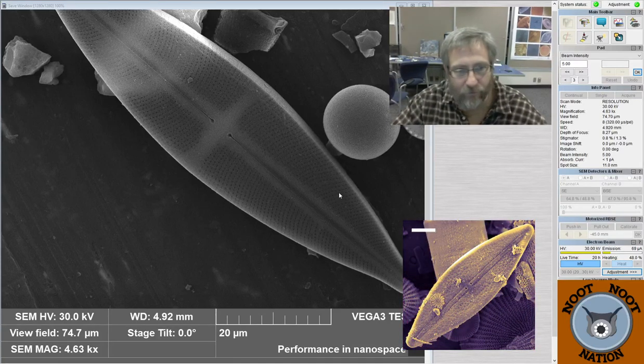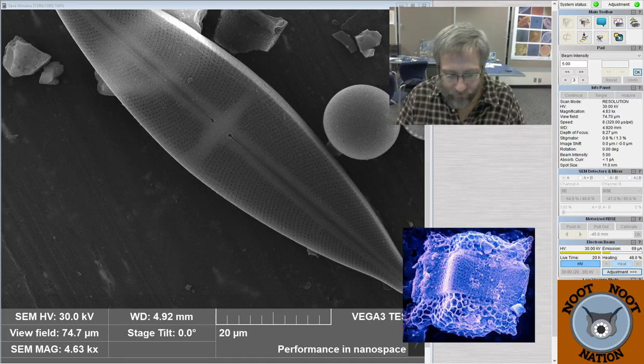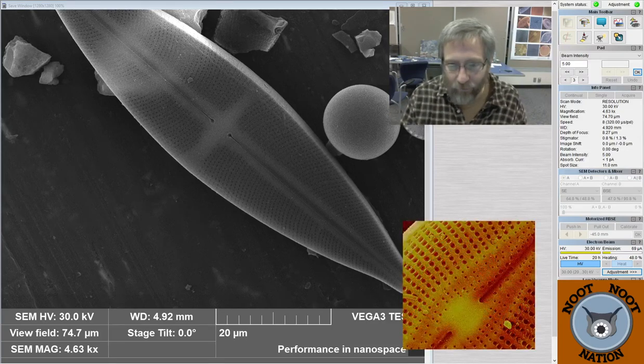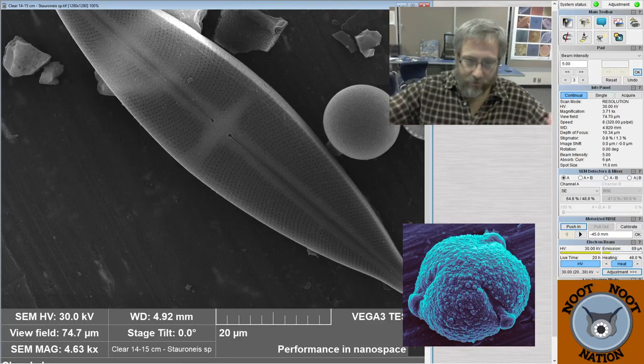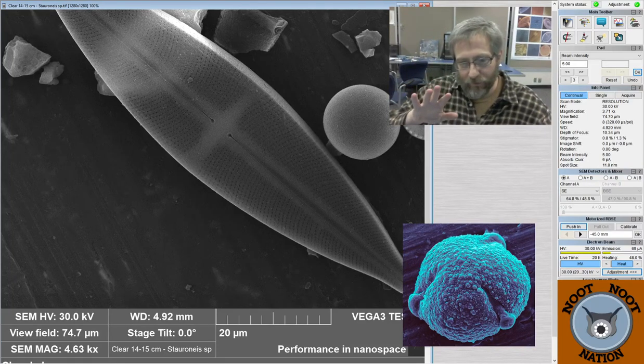The Tescan Vega 3 is the model that we use, and I actually really love this about it, which makes it easy. People tried to do this before we did ours, and they had a hard time with it because it's really hard to get the SEM to get you right into the right location all the time. To spin it around, which is normally what you would do with photogrammetry, you put the object on a lazy Susan, right? And it rotates around, and then you hold the camera in place and take pictures of it as it turns.